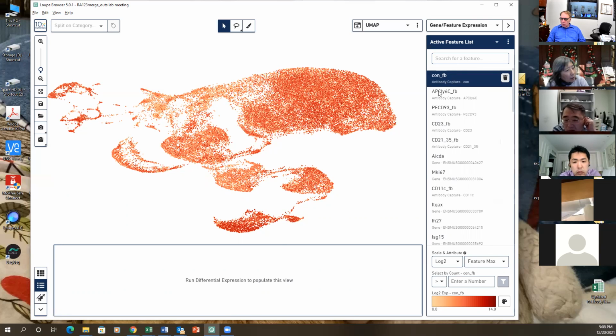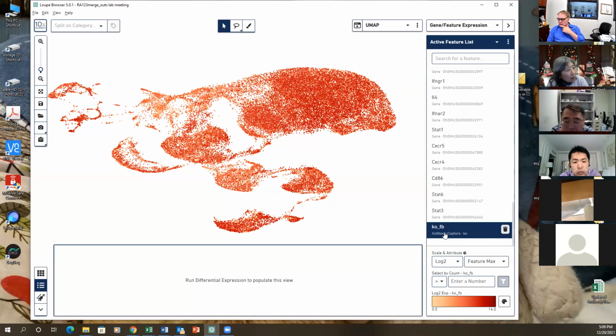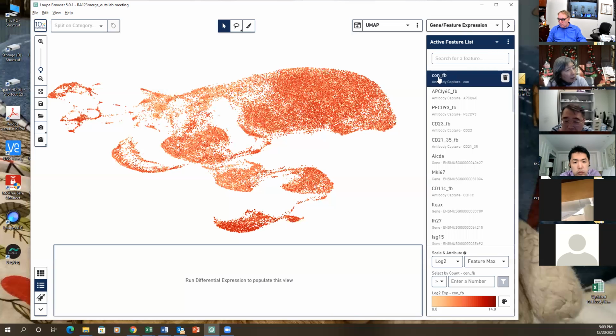There are a lot of them here too, but the antibody is weaker. This control antibody is not as dark as the knockout. The knockout is very dark. Why is that? I think it's an antibody thing. It's just generally weaker, except here.